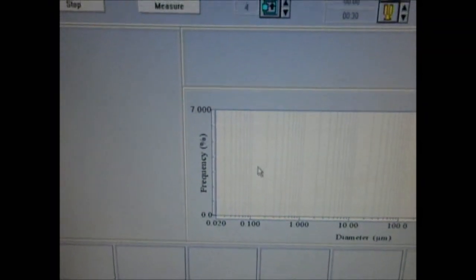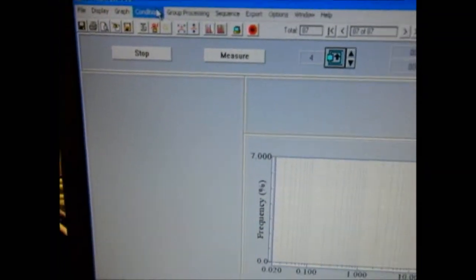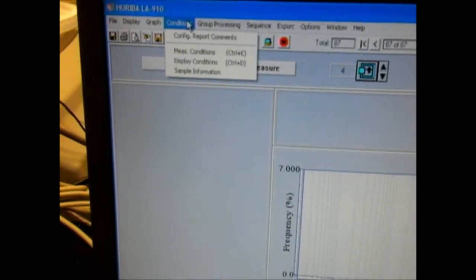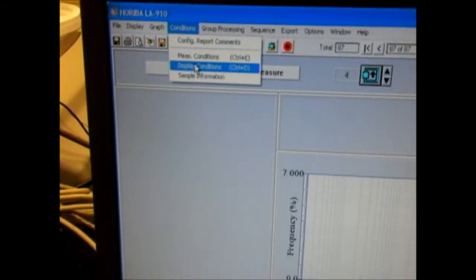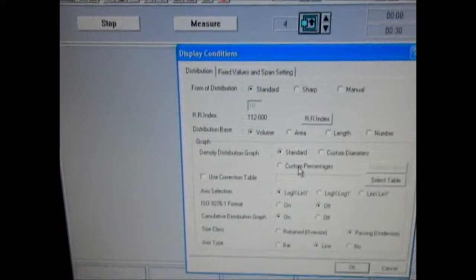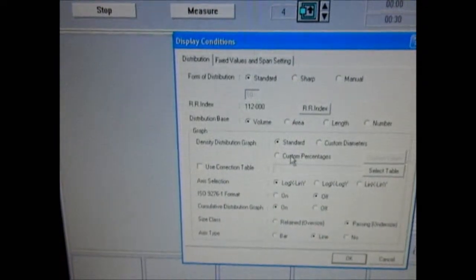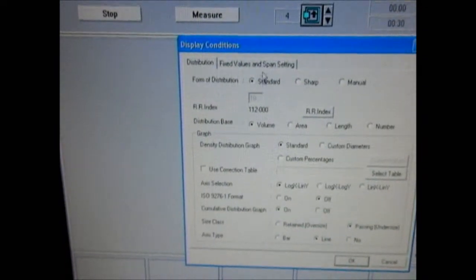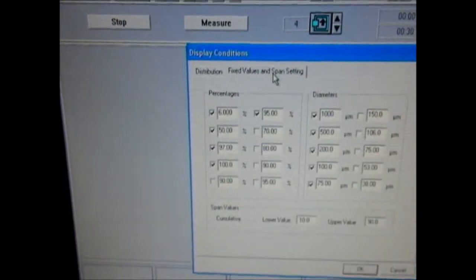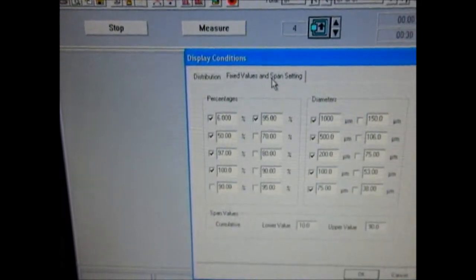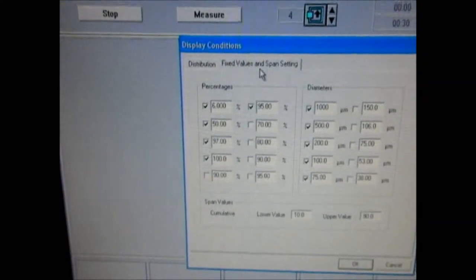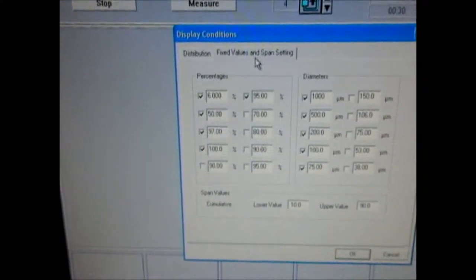This condition file should now open. Under the Conditions tab, I want to verify that the display conditions are the same, and the fixed values — which will appear in the report — are also the same as what I want.